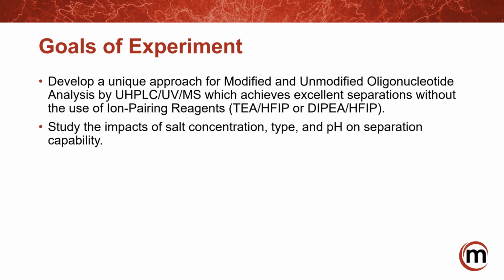The problem is that dealing with these additives creates other problems. When you put ion pair onto a system, it is now an ion pair system. They stick around all the time. So now you're dedicating systems, which is a big capital expenditure.